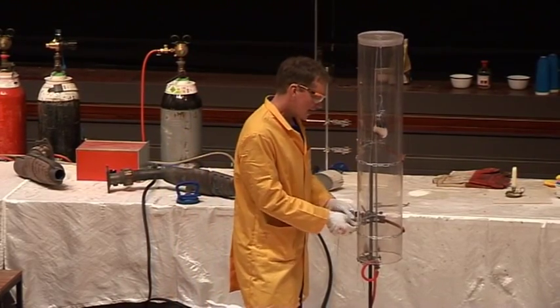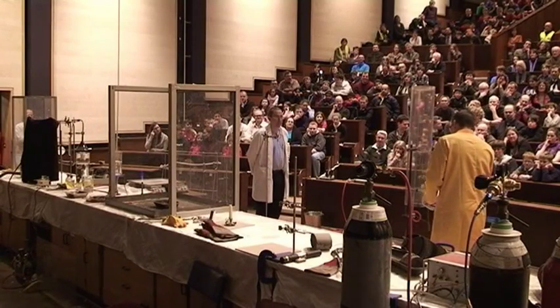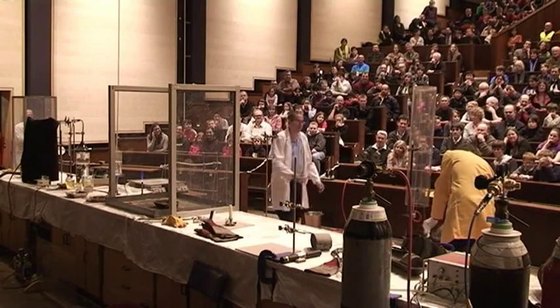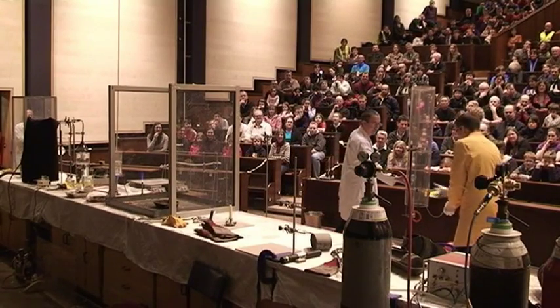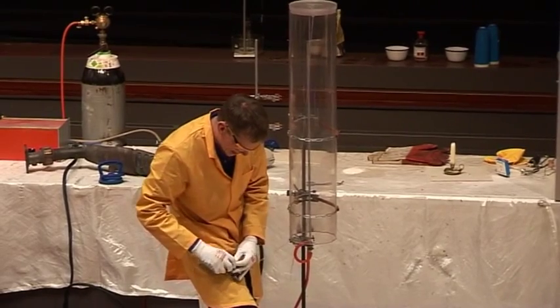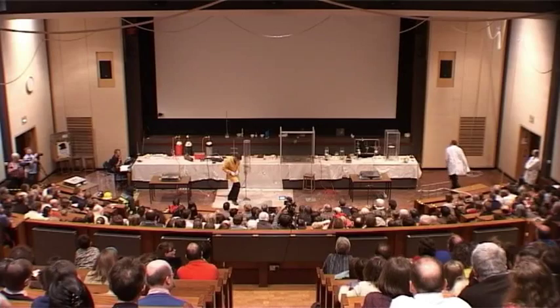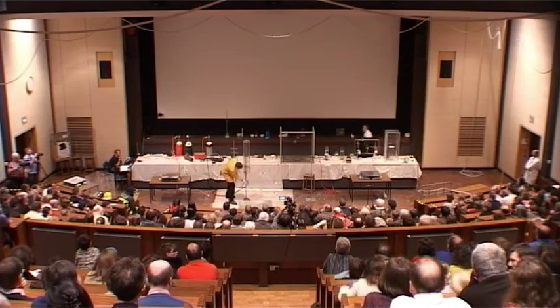So we have here a little tiny balloon filled with oxygen, and we're going to see if we can set fire to this in hydrogen.